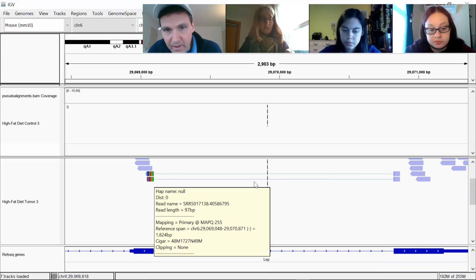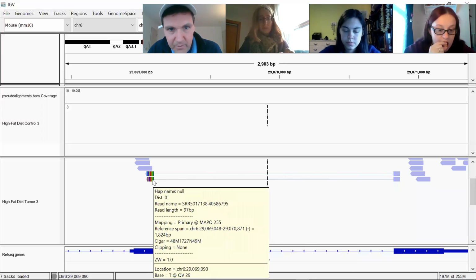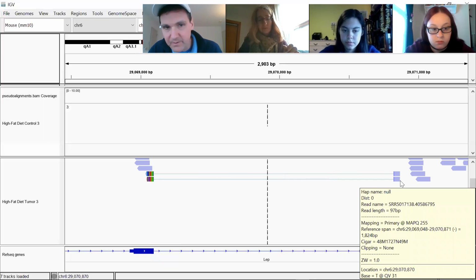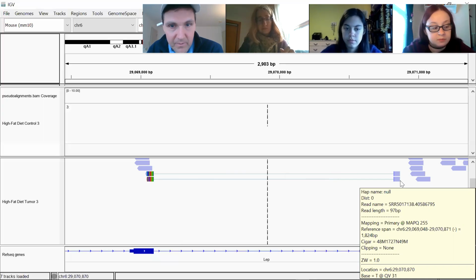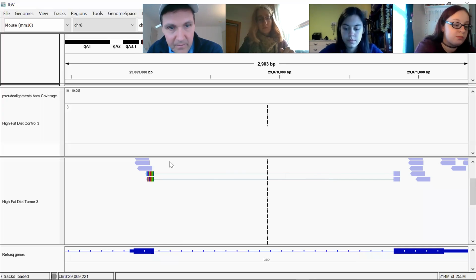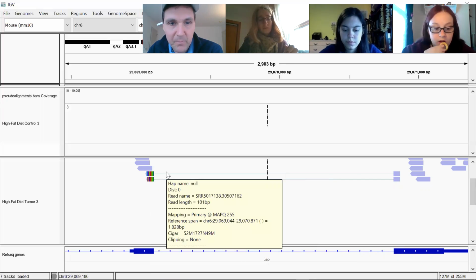Anyways, when you see reads that are connected across exons with a line, that means that it was a single read that covered the splice junction and has been connected bioinformatically, just to indicate that this is the same read that is on either side of the intron.